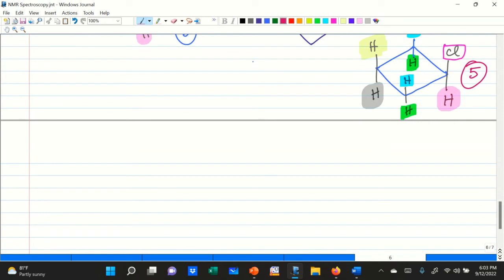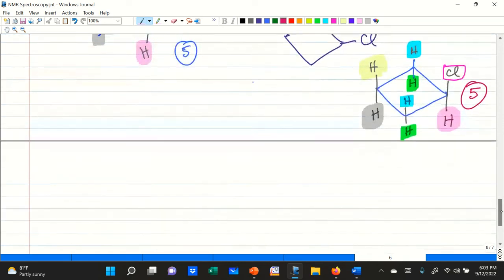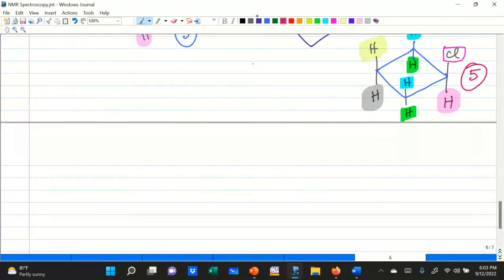All right. So these are the different types of protons indicated. Let's look at this one. Protons can also be classified in another interesting manner. I ask you to read it from Klein's textbook because of the time limitation that we have here. So protons can also be separated as what is called homotopic. I just finished this lecture in 263 a few days ago, or last week in fact.